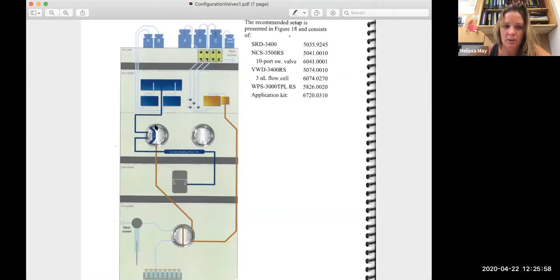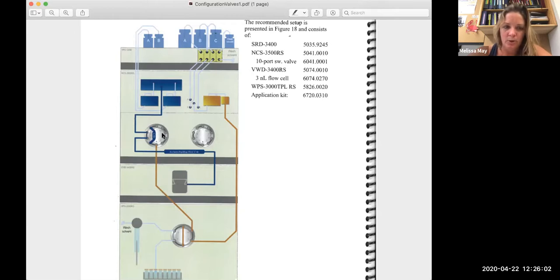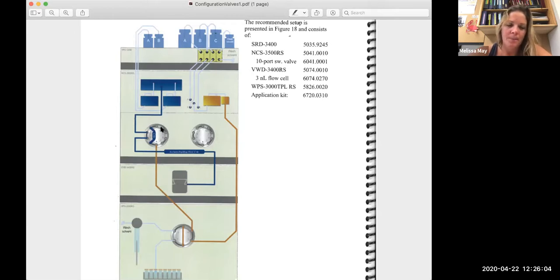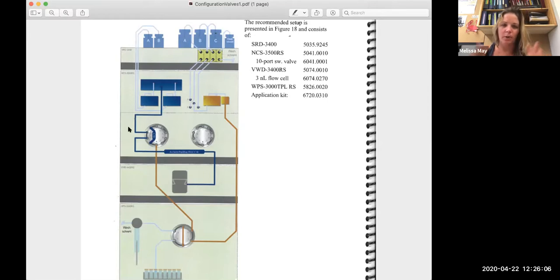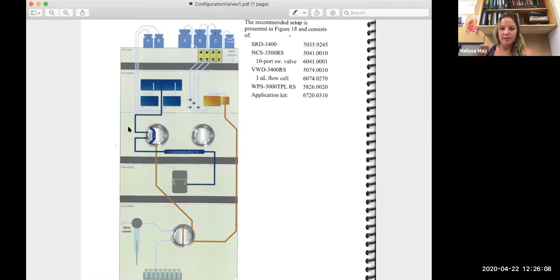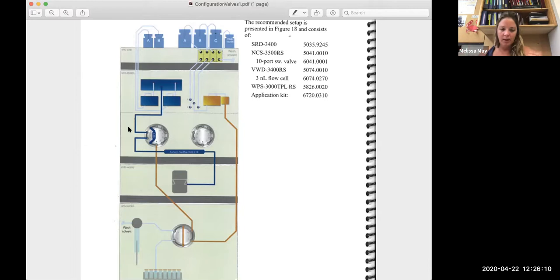And then in the ten-one position, basically that's going to switch. And so it's just different ways of aligning these different valves to put things in line or not in line.